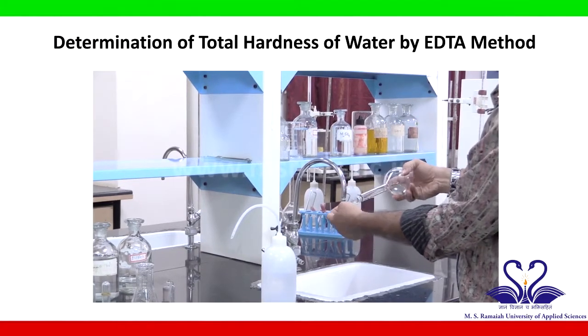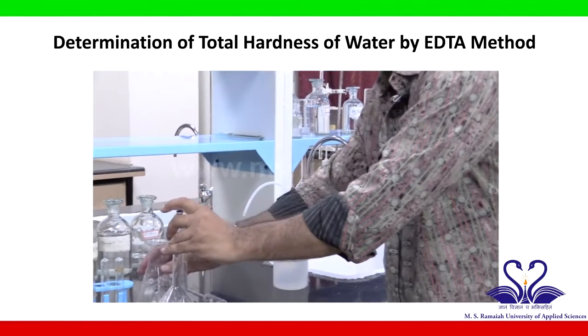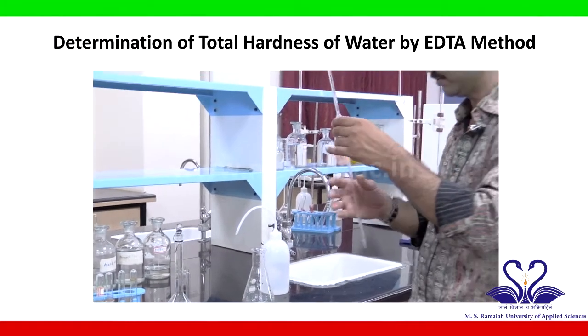Wash with water and then rinse with distilled water. The funnel also and the burette also should be washed.